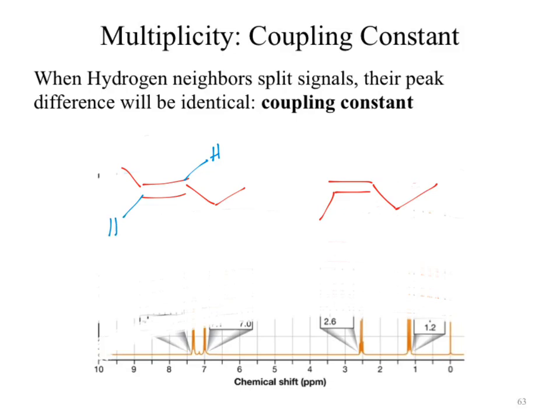If we take a look at the hydrogens involved on our double bond, do they see each other differently in the structures? Yes. If they see each other differently, what changes? The coupling constant. We can tell the difference between these 2 structures in the spectra by measuring the coupling constant for the hydrogens in the double bond. I don't think I asked any questions on it in the SMART work, because it is a very complex thing to look at, and again, fairly rare. We might throw that back in as a pop quiz, but we won't see that on this next test.